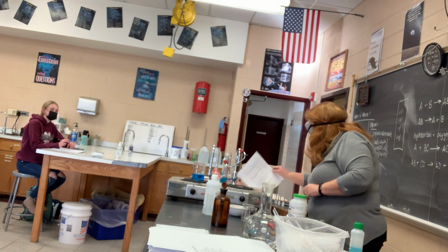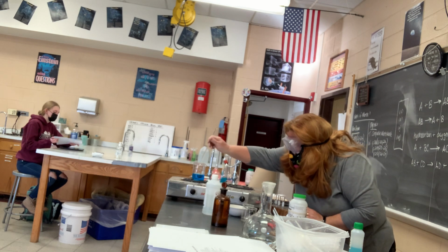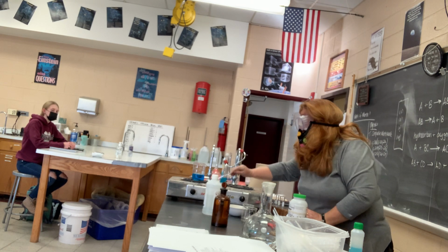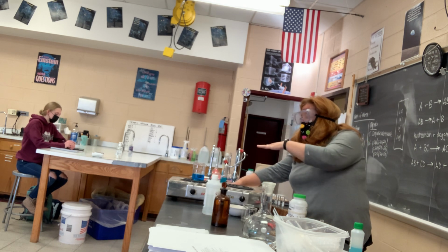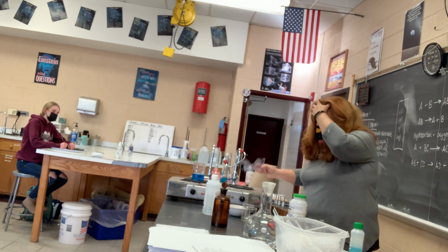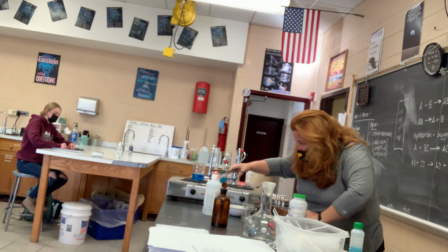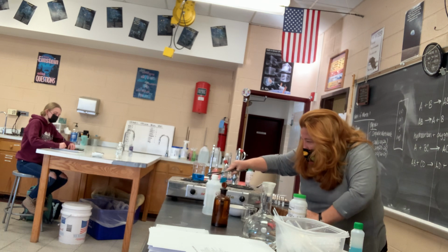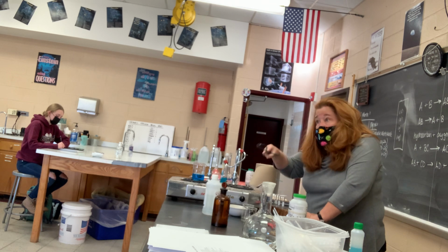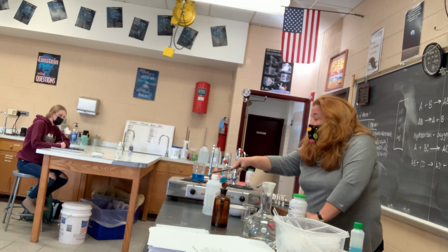This was letter D. I don't know what's happened. There's bubbles all over the place. But little pieces of copper will start to float on the top. So maybe I should put a smaller piece of copper, but that's what's happening. There are little pieces of copper that are forming out of the copper sulfate. So the zinc is replacing the copper, and there's pure copper being formed as this is happening.